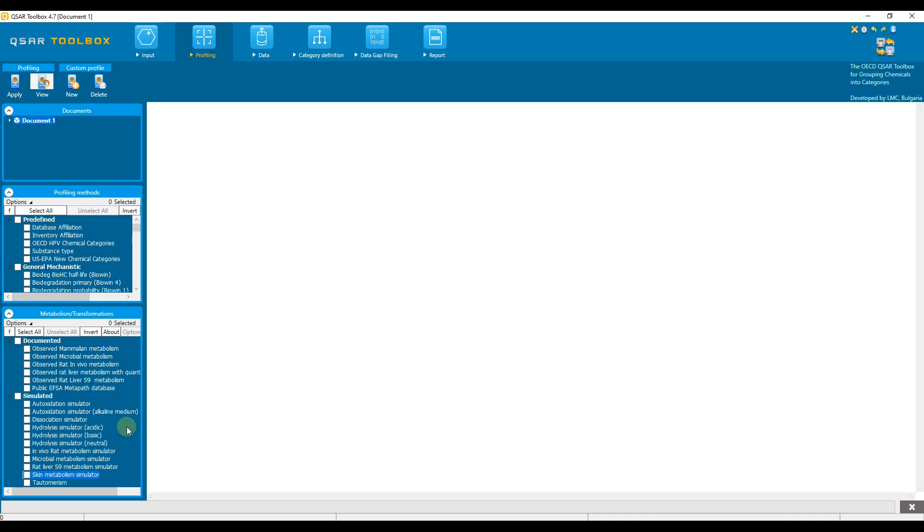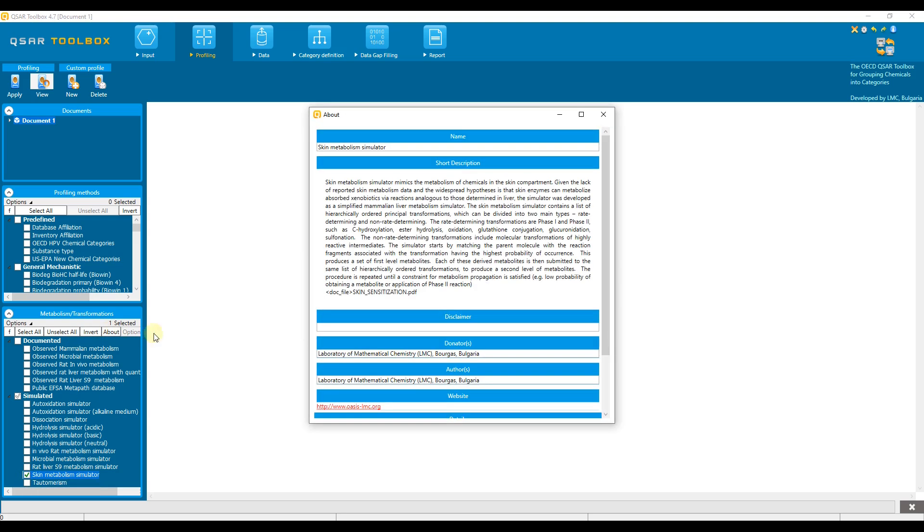For each of the documented and simulated metabolisms there is a short and a detailed description. To see these details, one must select a documented or simulated metabolism, such as the skin metabolism simulator, and then click on the about button in the panel of the section.